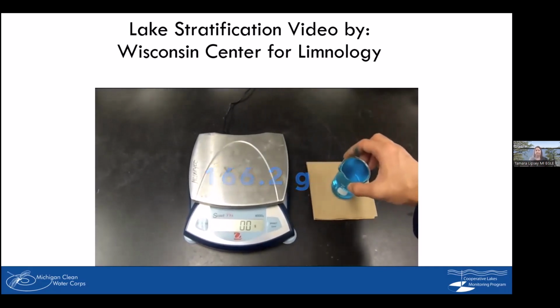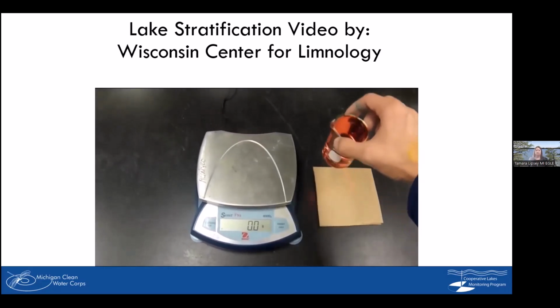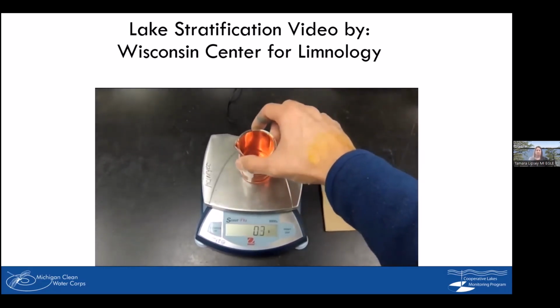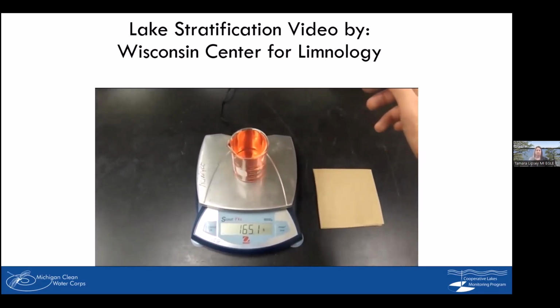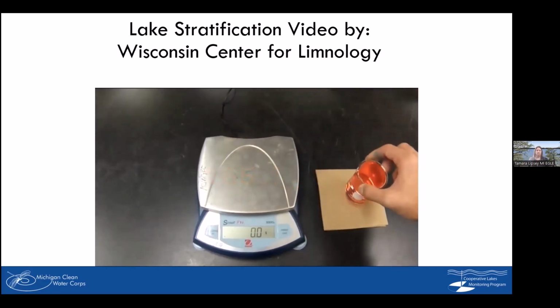166.2 grams. Now we've emptied the cold water and refilled the beaker with the warm water. And the warm water weighs in at 165.1 grams, a little bit less than the cold water.